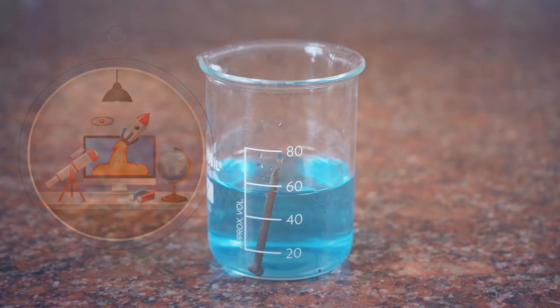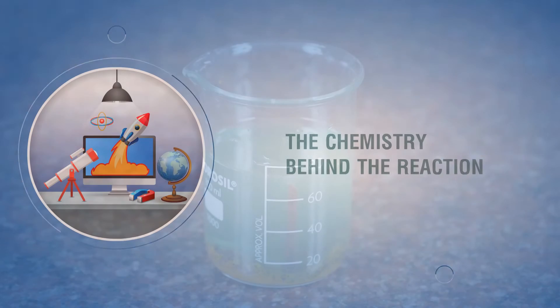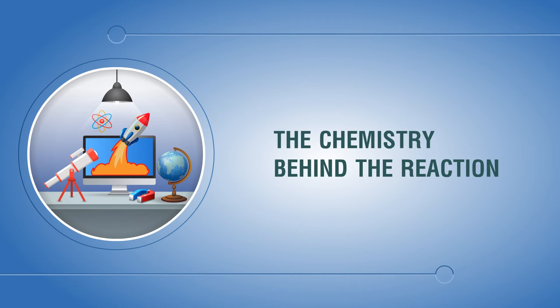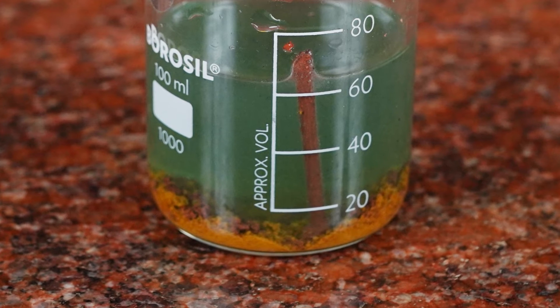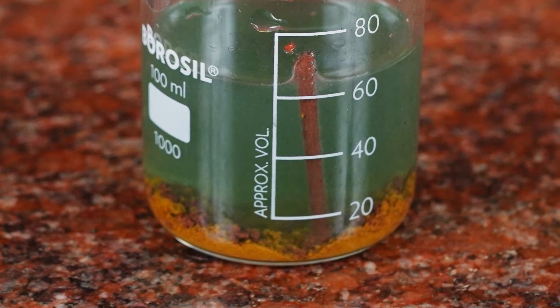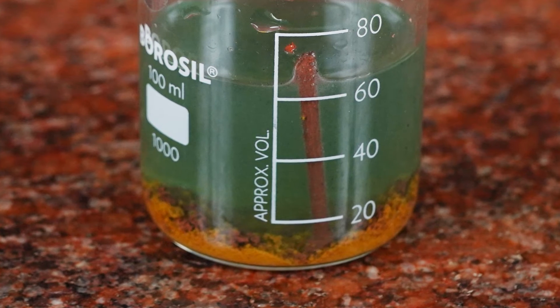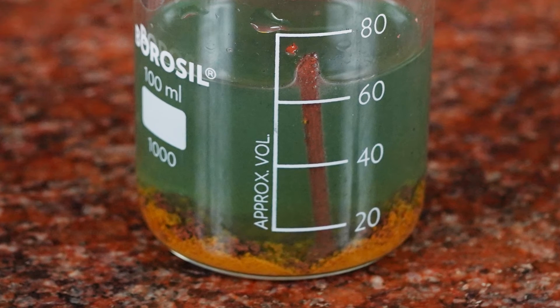Observations: The blue color solution of copper sulphate first fades and then changes to green, forming a brown deposit on the iron nail. The brown copper metal is deposited on the nail due to its displacement from copper sulphate by iron. The green color of the solution is due to the formation of iron sulphate.